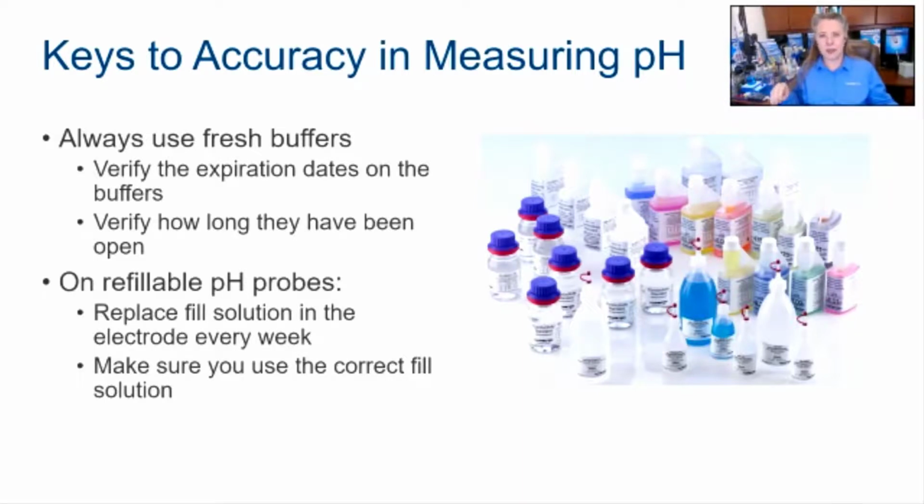Hamilton's buffers last a tremendously much longer time than any other manufacturers because we add a crazy amount of extra buffering capacity. But typically a buffer is good for roughly 2 to 3 months after opening, as long as the color is good. If it's a pH 10 buffer, you've got roughly 3 to 4 weeks from the time you open it to the time you need to throw that bottle out. The CO2 in the air actually causes a shift in the pH of your solution and your buffers over time. So if you do not have enough buffering capacity, your buffers will go bad quickly and the color will change quickly.